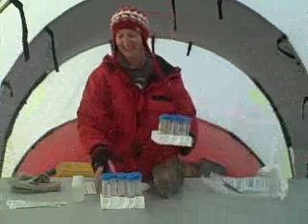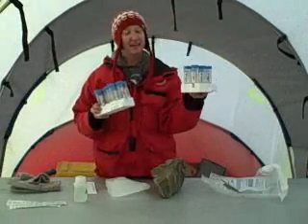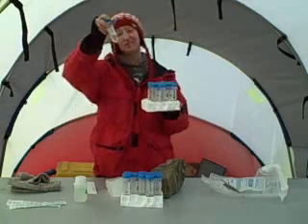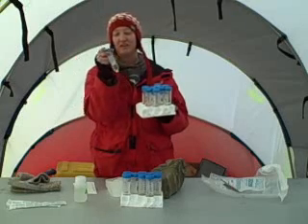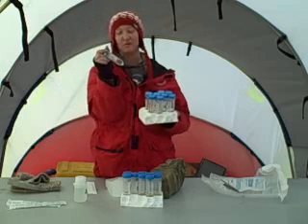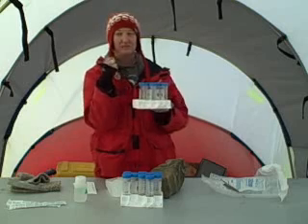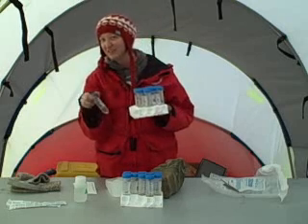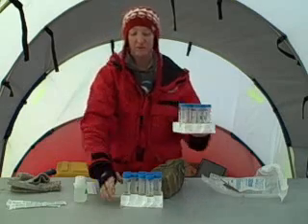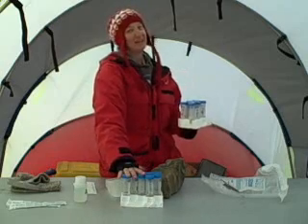Today we're going to look at these 18 different tubes for our experimental design. We have 9 that are going to go outside and 9 that are going to go inside. Inside each one of these tubes, we have already pre-made media. What this media has in it is basically just liquid with all the food that microorganisms like to eat. So hopefully when we add microorganisms from places like the dirty ice, from the clean ice, from our hands, from our feet, we hope that it will grow. And then we also hope that we'll see a difference between the ones that we keep in the cold versus the ones that we keep inside in the warm.